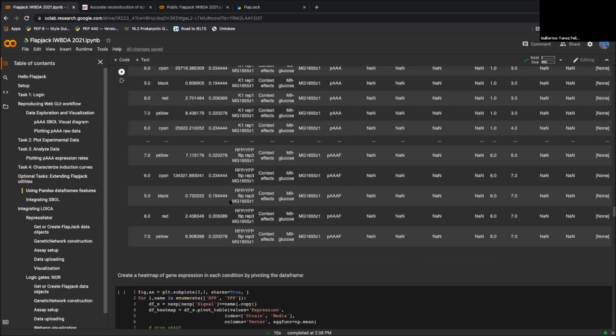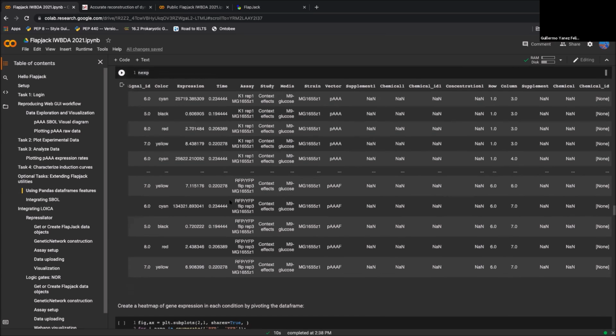Something I would like to add. Maybe Michael wasn't there when Carlos was presenting how to upload data, but roughly, when you get the file from the plate reader, for example, you fill different sheets. In the media sheet, if you don't want to include that well, you just put none, and that well wouldn't be included. For a 96 well plate, now we're just able to upload 96 well plates, but it's just a matter of a parameter, and that's it.